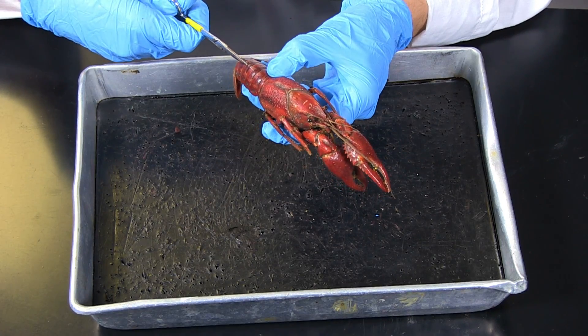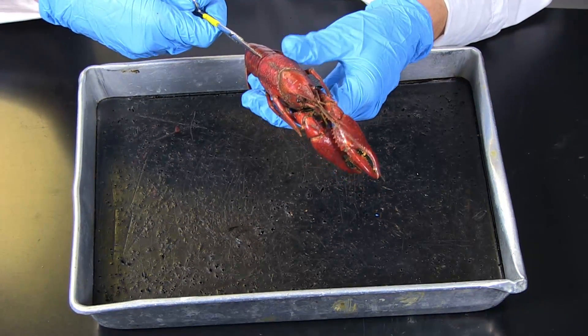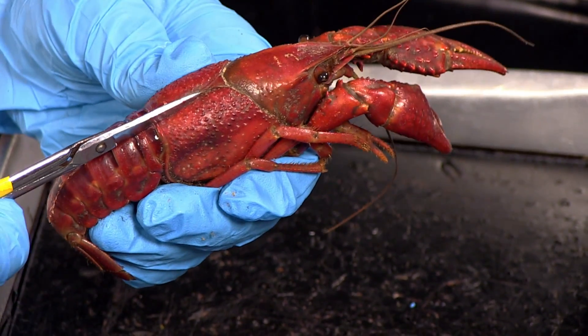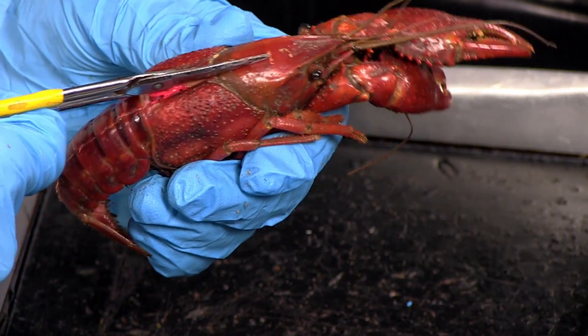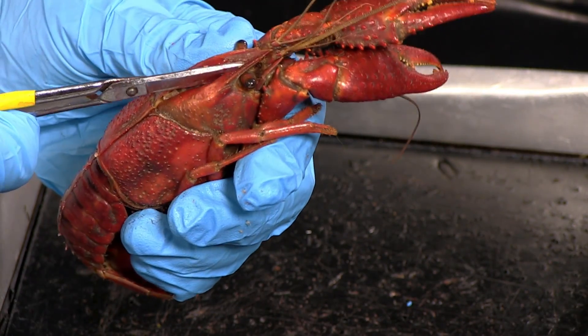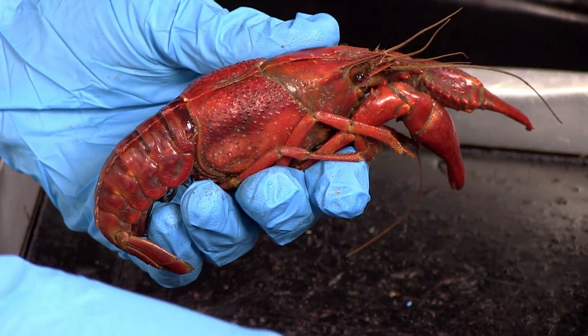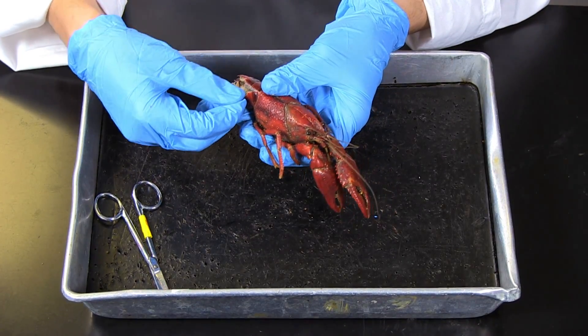Begin the dissection by cutting up the exoskeleton from the tail to the eyes. Make sure your cuts are shallow so as not to cut into internal organs. The scissors should be parallel to the exoskeleton. Hold the exoskeleton up and cut just underneath it with only the point of the scissors. Carefully detach the exoskeleton from the muscle attachment underneath.